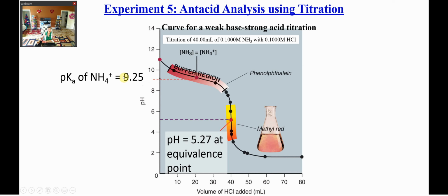then you titrate a weak base, for example ammonia. So your pH value starts bigger than 7, then slowly decreases in a certain region. This region we call the buffer region. And you are also going to see a certain point you call the half titration.